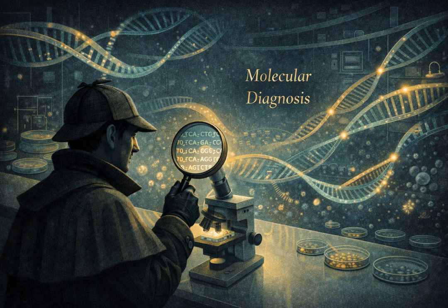Which would float around the lab. And land on your workbench, on your pipettes, on the next patient sample you're setting up, causing massive contamination and false positive results. Real-time PCR almost completely eliminates that risk of amplicon carryover. It's cleaner, safer, and faster.